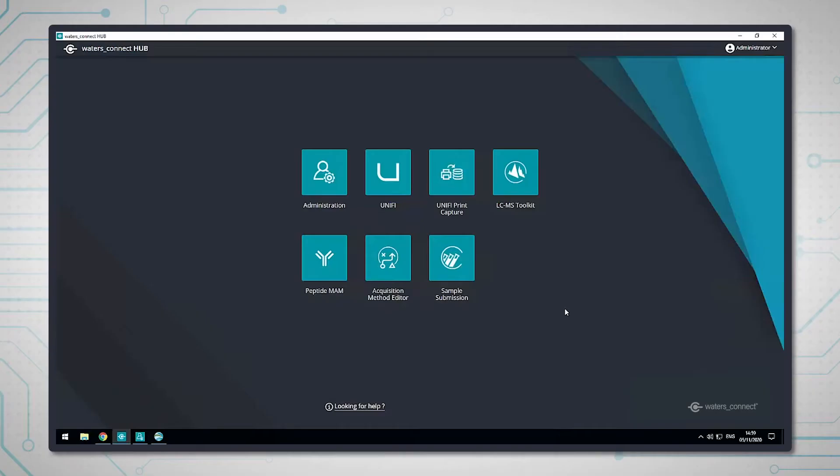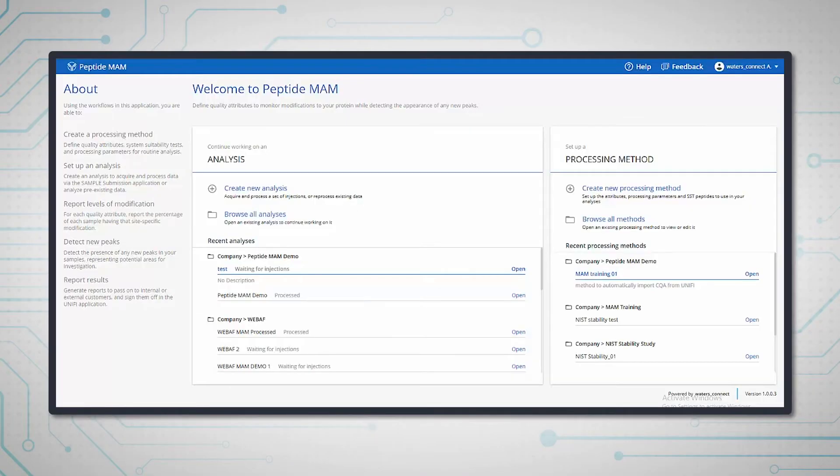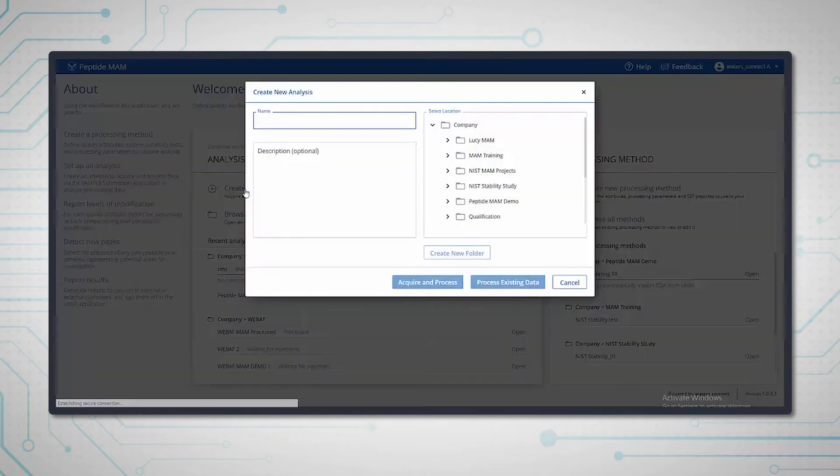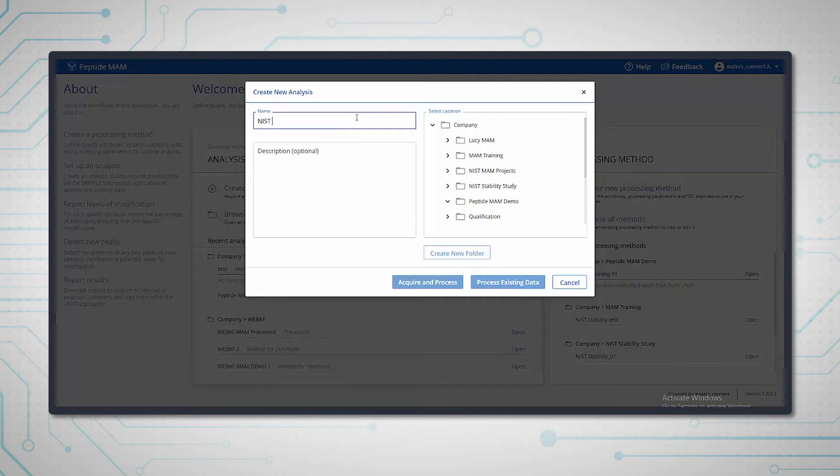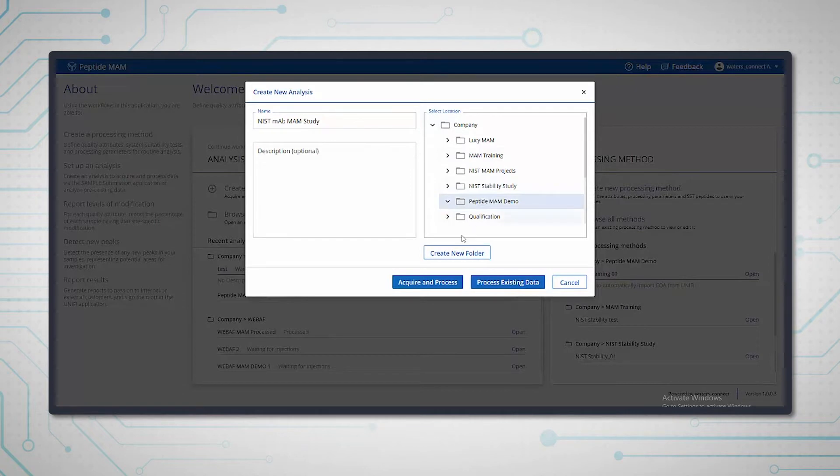In this section, we're going to create an analysis. We're going into the peptide mam app and choosing create new analysis. We'll specify the folder to save the analysis in, and I'm going to call it the NIST lab. I'm going to choose to create an acquire and process analysis.